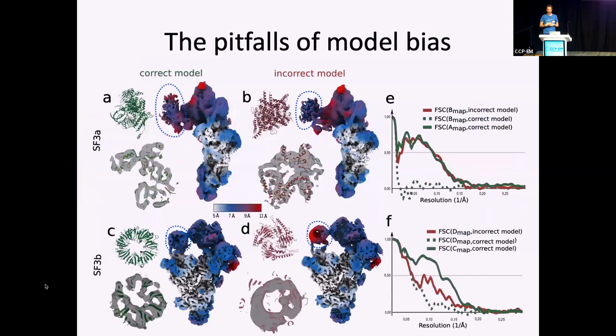And we showed actually, so Johannes did some controls where we put the right model in a very floppy part of the spliceosome, or the wrong model in, so deliberately a wrong model. You can actually generate density of the wrong model very beautifully in the most floppy parts of this structure. And based on FSCs, that would all still make sense, but you're now doing Einstein from noise. So there's enough parameters in your VAE network, just like there's enough parameters in all the rotations and translations in the conventional alignment, to actually invent things.